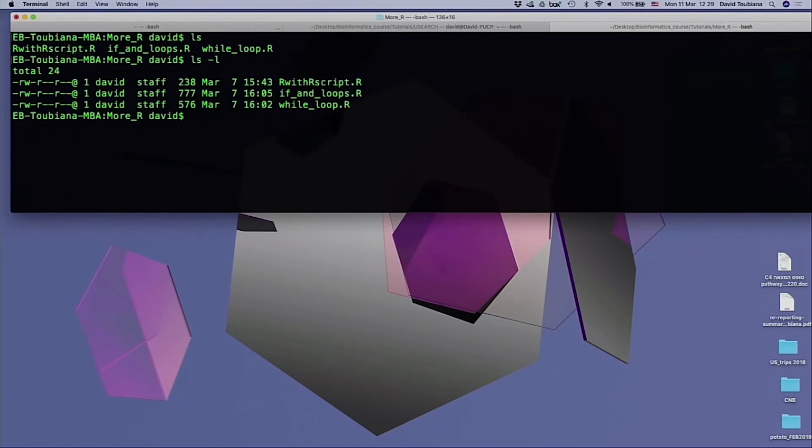What we usually do, instead of ls -l, is use a quicker command, but it only works on Linux, so I cannot show you this. It gives you the same thing, but it's just ll. So if you do ll, it basically gives you ls -l. Another thing you can do is add h, which means human.